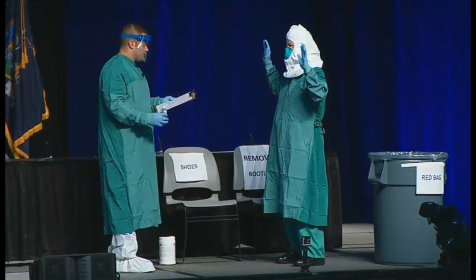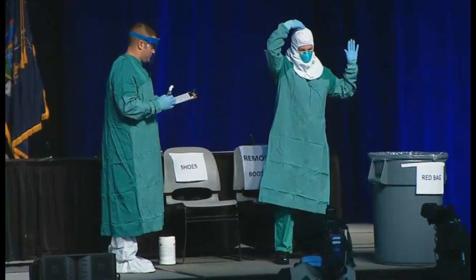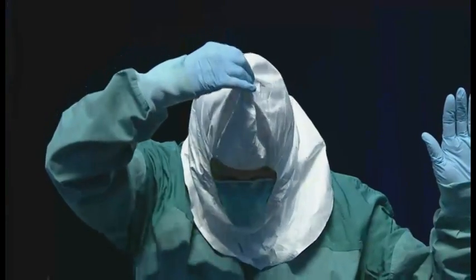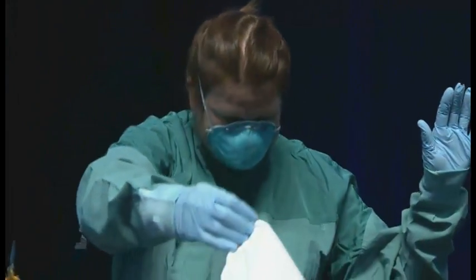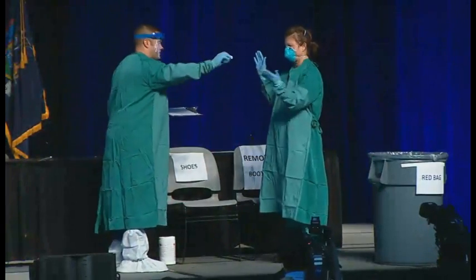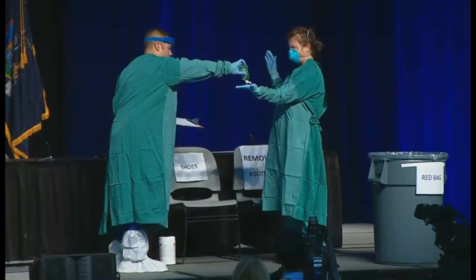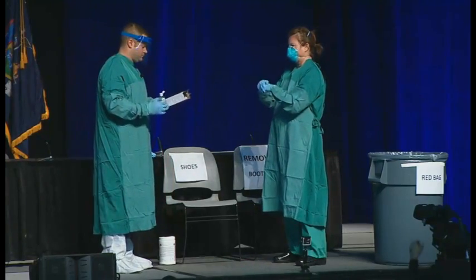Similar to the face shield, Barbara is going to tilt her head slightly forward and carefully remove the surgical hood. Again, we will perform hand hygiene. You get a sense from this that you'll need a fair bit of alcohol hand rub in the area where you're going to be taking off this equipment.